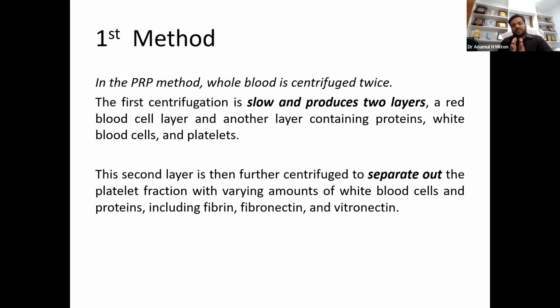After that comes the second centrifuge, the high or speedy centrifuge, where we use more than 3000, like 3400 or sometimes 3200, or some books suggest 3600, because it depends on many factors. So these total 50 lakhs are concentrated within 4 to 5 ml. That means this 5 ml contains the 50 lakhs of platelets.